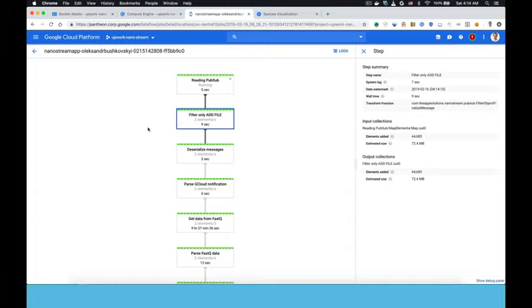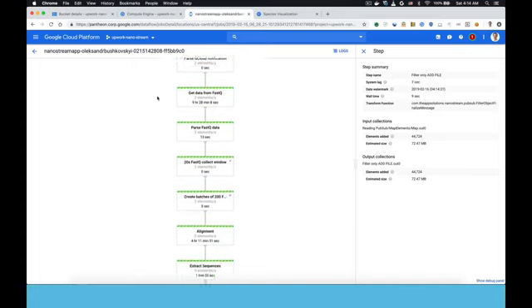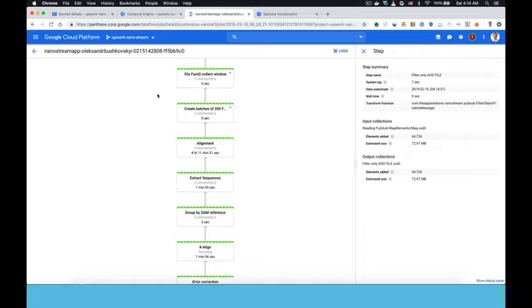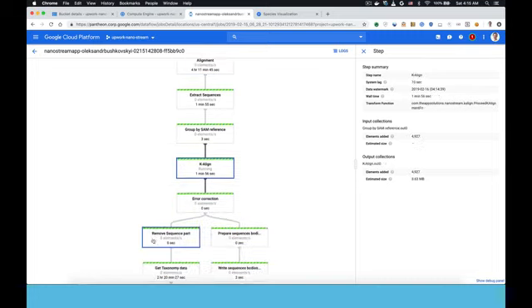So you can see here's where files are being added. Then they go in batches of 200 sequences to an aligner. This is calling out to the alignment cluster. And those alignments are grouped and consensus is reached using k-align.